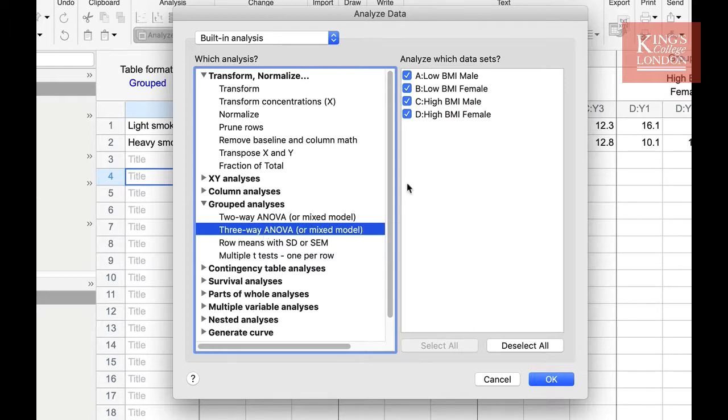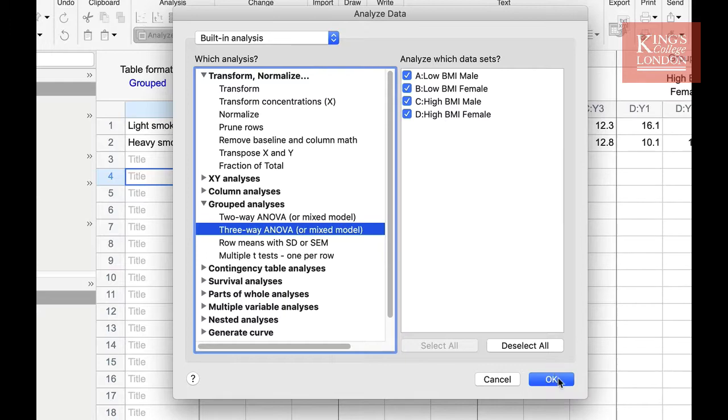By default, Prism will select your groups. We have four groups and these four groups are selected. Once you have decided on the groups you wish to analyze, press OK.